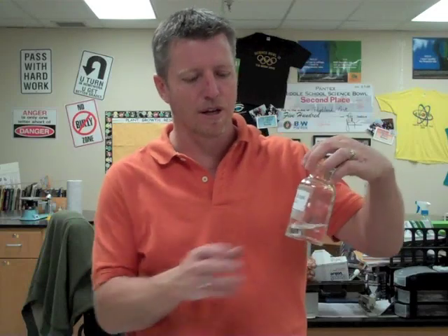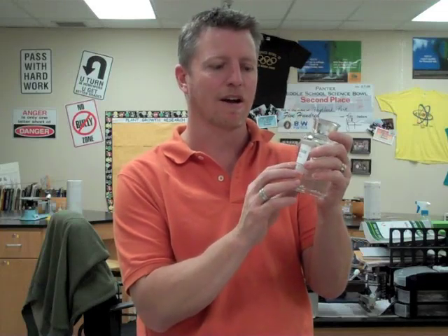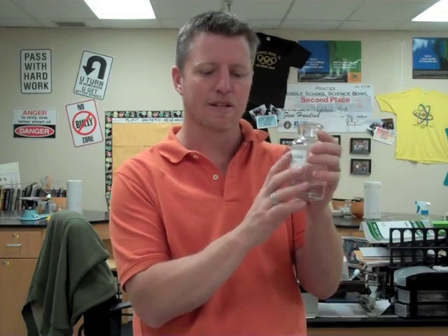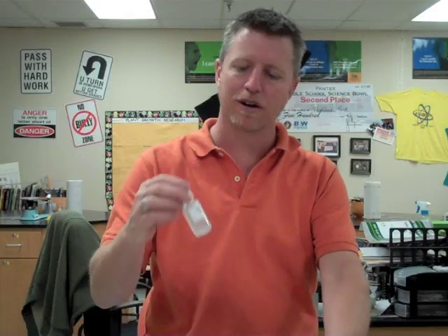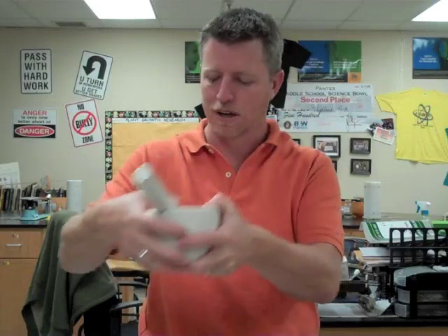We're also going to use club soda, which is H2CO3, which means it has two atoms of hydrogen, one atom of carbon — there's no number next to it — and O3, which is three atoms of oxygen, giving us six total atoms per molecule of that compound. We also have water — most everybody knows that water is H2O: two atoms of hydrogen, one atom of oxygen. And then we're going to use some graduated cylinders and a mortar and pestle to crush our chalk up today.